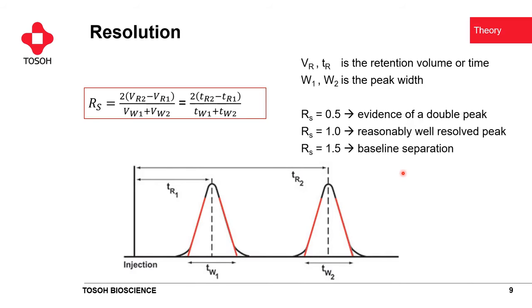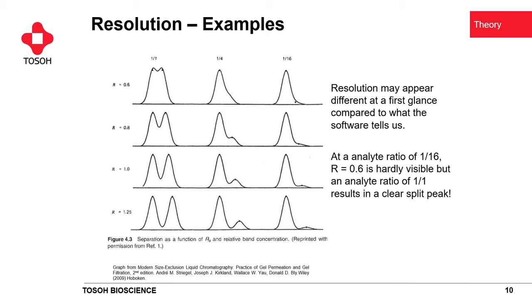But I would like to hint at one phenomenon: that resolution numbers do not always tell us how well we see two different molecules in the SEC chromatogram.